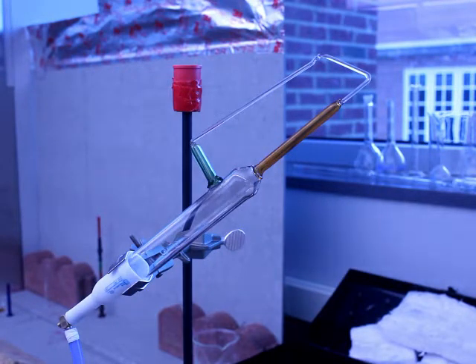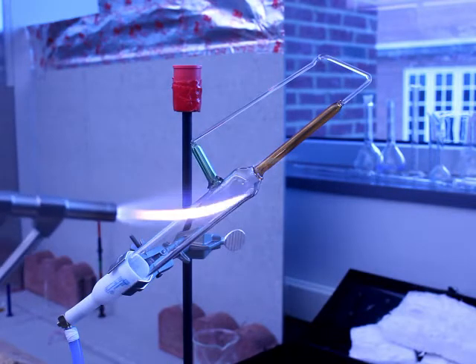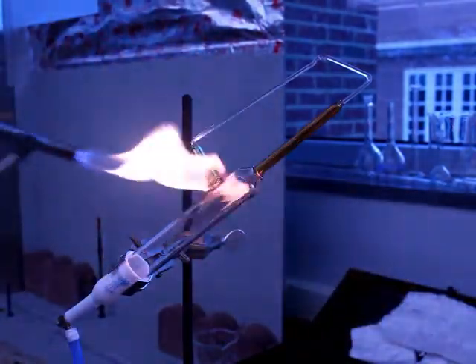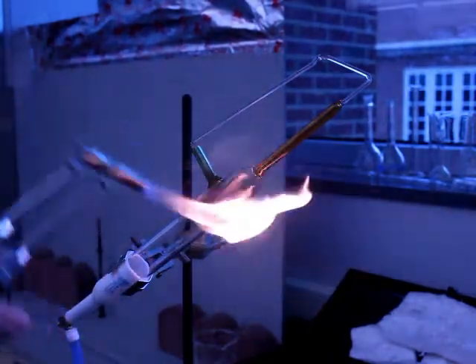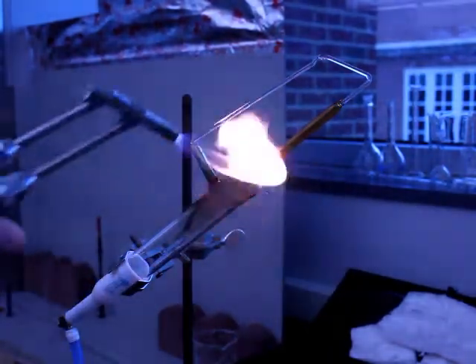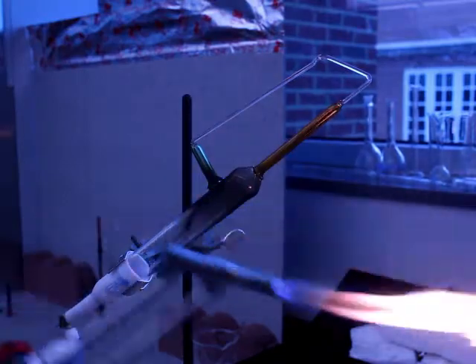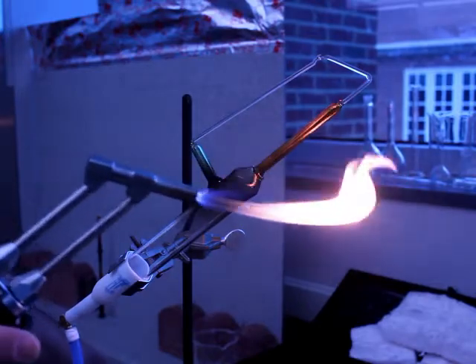Now I have the piece attached to a ring stand, clamped, and I have the hand torch, and I will have the blow hose in my mouth, and my plan will be to come in here and clean this up a little bit. First, let me warm this up a little bit to hopefully prevent it from cracking, which is very possible, if not probable. There's still a pinhole that I need to repair. Let's see how that goes.